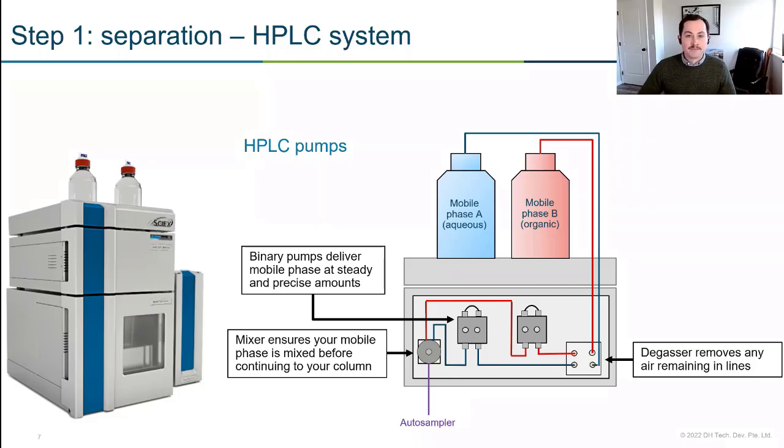for the aqueous. So from our eluent bottles, we have our mobile phase moving into our degasser. And our degasser is simply doing exactly what it sounds like it's doing. It's removing gas. Maybe previously you've seen people in the lab sonicate eluent bottles to get the bubbles out. With most modern systems now, we can just rely on this degasser to get those bubbles out, so we don't have to do that extra step.